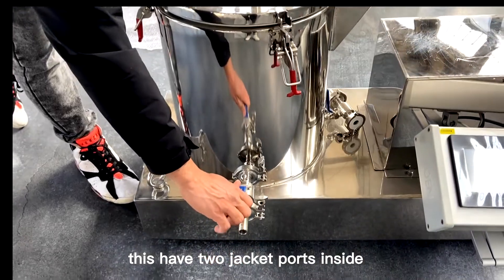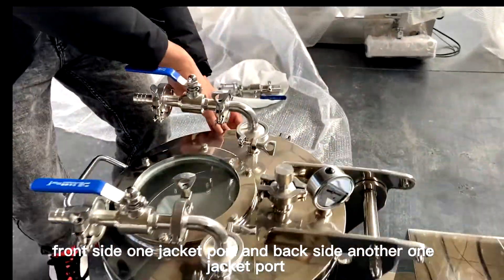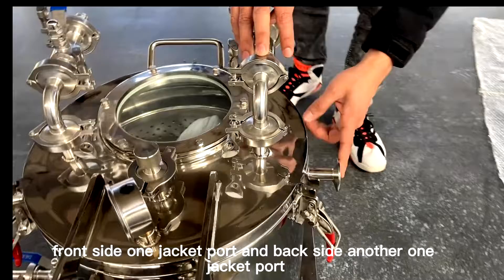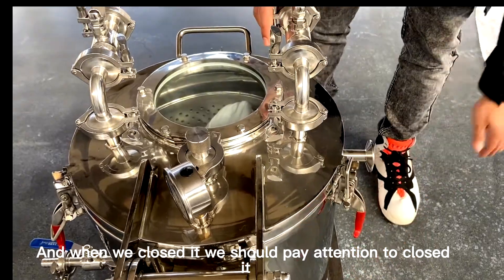This machine also has two jacket ports — one jacket port on the front side and another jacket port on the back side, as you can see here. When we close it, we only need to close this section.